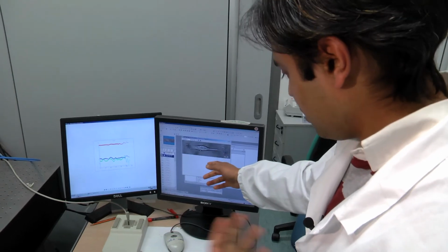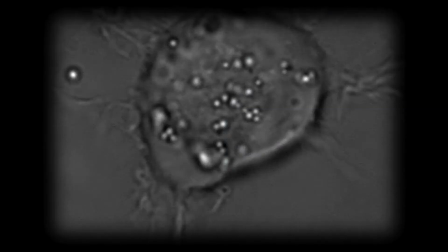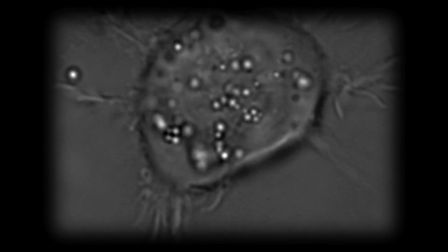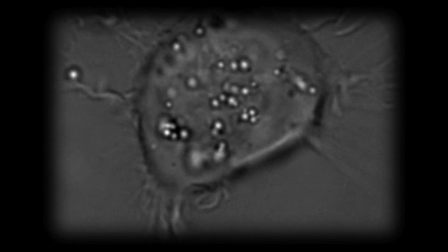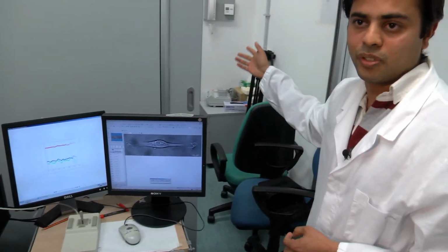So here is the new type of experiments we started to do. We started to acquire the video, the Z-stack imaging of the whole neurons, and about which my colleague will tell you more.